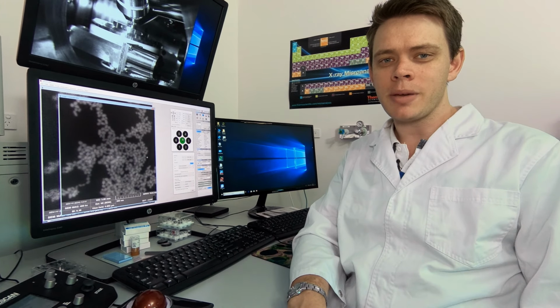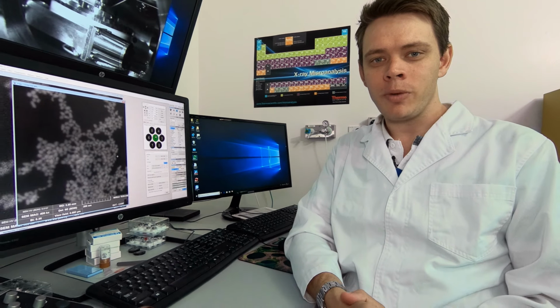I hope you've enjoyed this demonstration of how we can use SEM to image and characterize your particles. All the best with your reports, and I hope you enjoy getting your teeth into all the data that we've generated here at CARF for you.